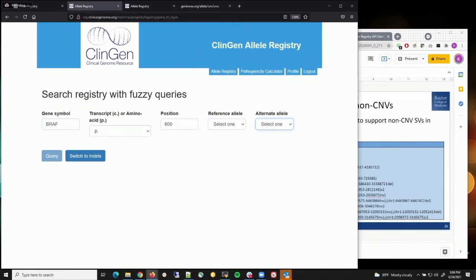Please discuss present and future support for haplotype identifiers. Yeah, so we have some support for haplotypes existing in Allele Registry. I'd be hard pressed to find a good one in a short amount of time. Yeah, so there's some ongoing work that we actually need to continue to do to support what we are considering a genome build and what it means to have something different from your standard diplotype versus haplotype. If you could put your email address down there, I'll be able to send you something after that. I'll look it up during the next talks. But yeah, I can give you a couple examples though.